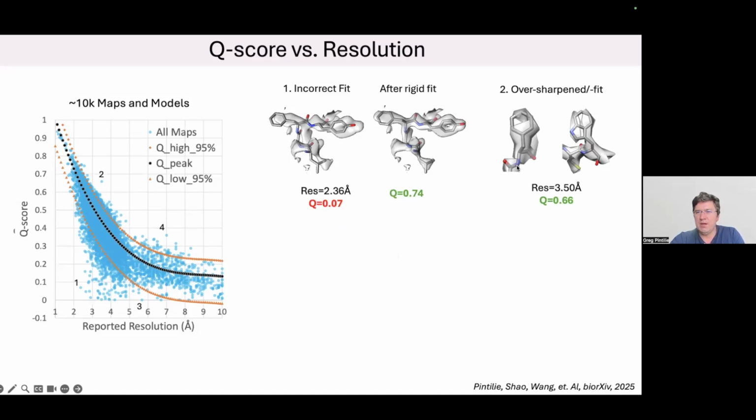But with this point here in particular, it was kind of interesting because if you look at the map, it has this broken, noisy-like shape or features. And this tends to indicate over-sharpening, which is possible. A lot of times with sharpening, we try to boost the detail in the map by amplifying the higher frequencies.